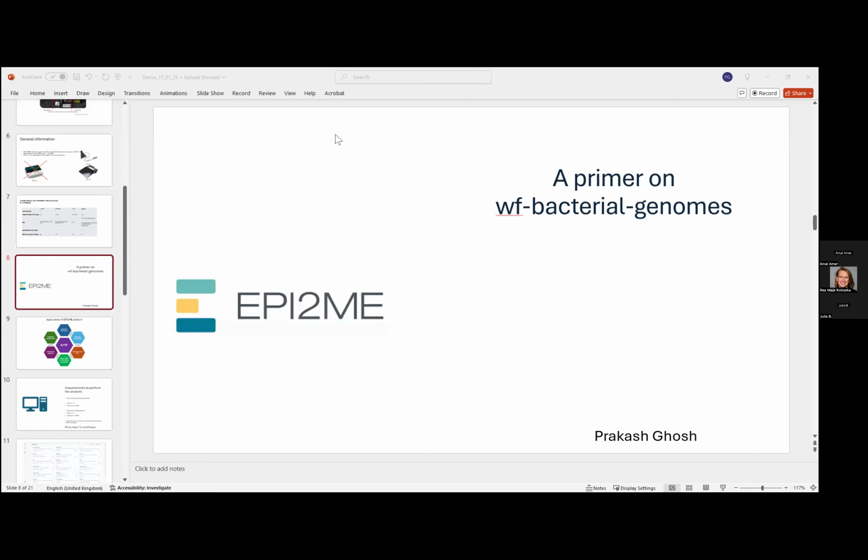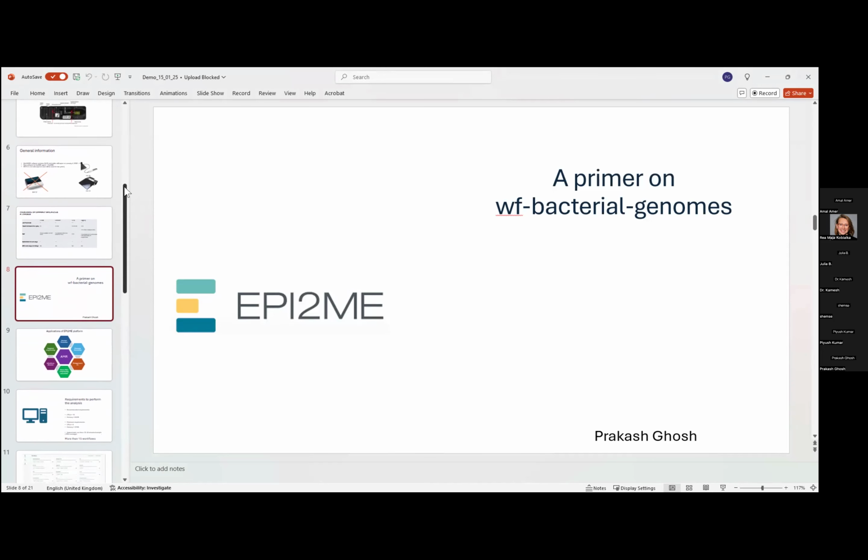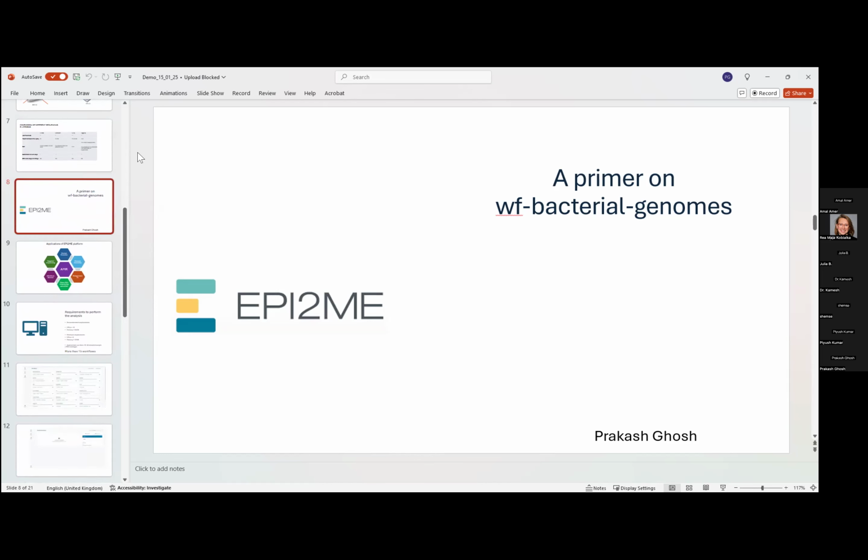Thank you, Ria, for the very nice introduction to nanopore sequencing. Hi, everyone. I'm going to present EPI2ME. Before going to the presentation, I would like to give a brief introduction about myself. I've been working as a PhD student at the University of Leipzig, and I'm also working with Ria and Ari. So let's have a brief primer on EPI2ME.